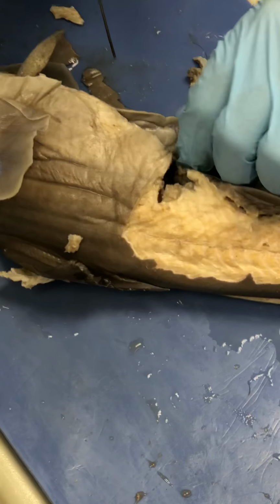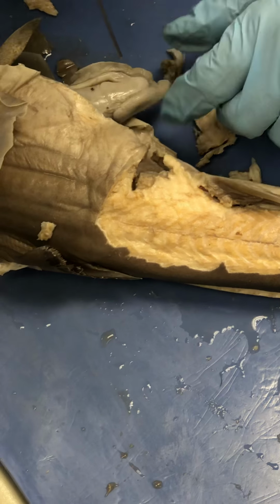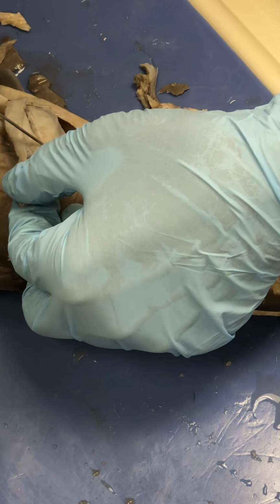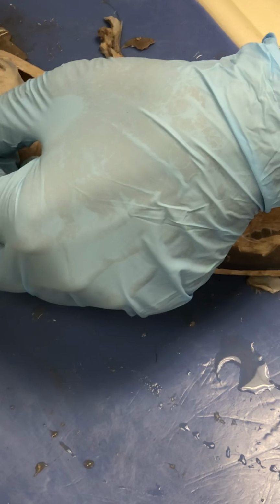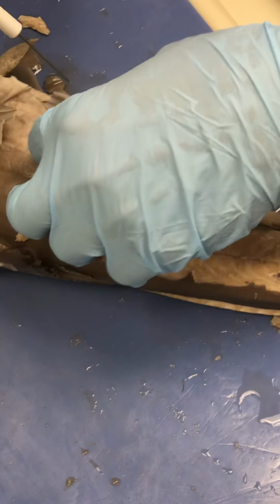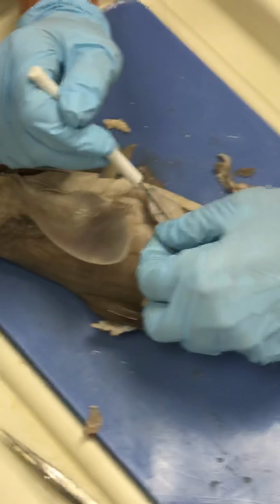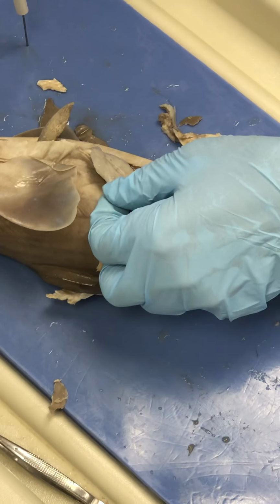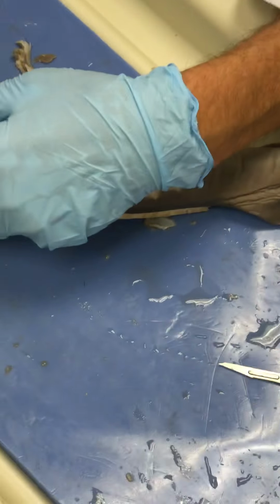Right here. You see how muscular it is? What's that called? Pancreas? Nope. Is that the spleen? Nope. This is where it goes from the stomach to the small intestine. Duodenum. You got it. The duodenum or duodenum, depending how you want to say it.